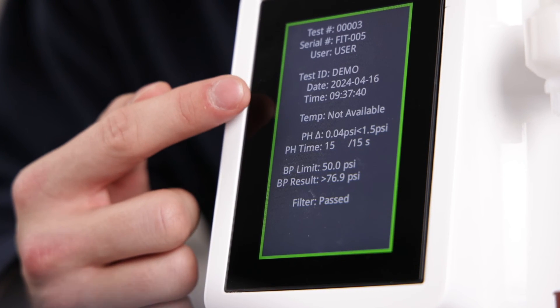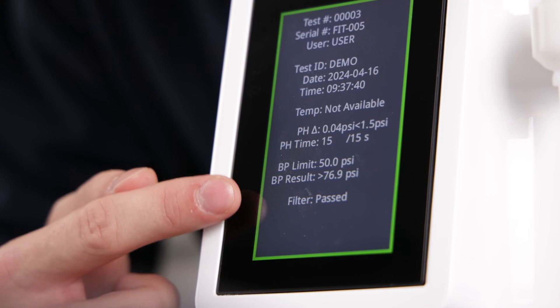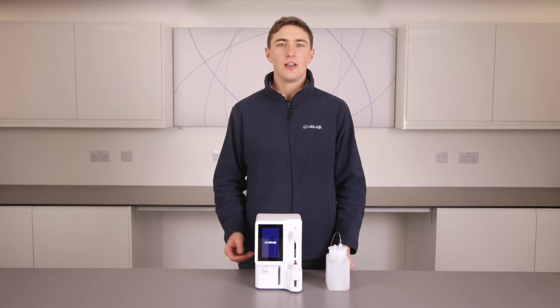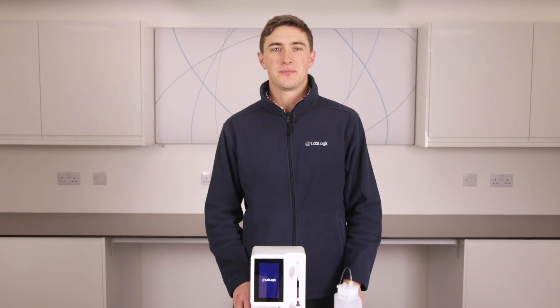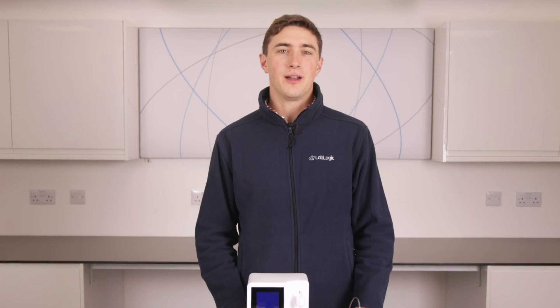The summary includes the test user who was signed in, the test ID and the date and time conducted, the test pressure that was set, and the test result — either pass or fail. All the tests performed are stored on the unit and may be transferred externally to an administrator's computer with a USB connection via PDF or CSV format.